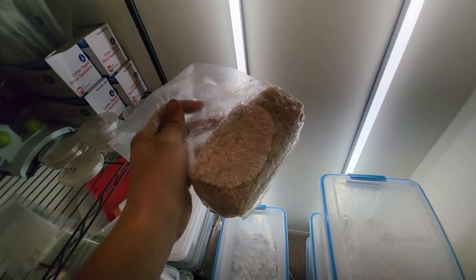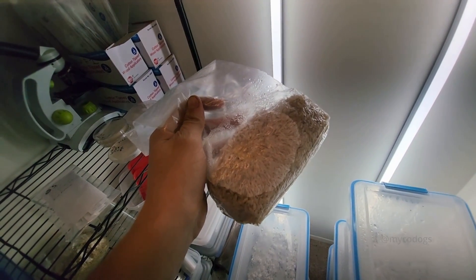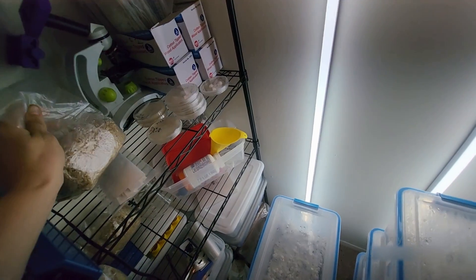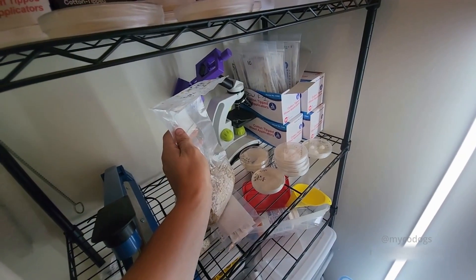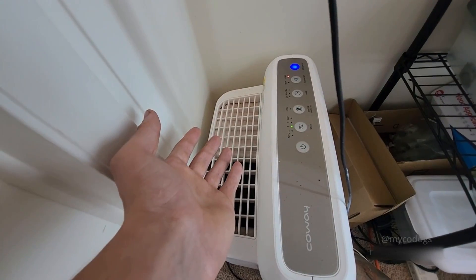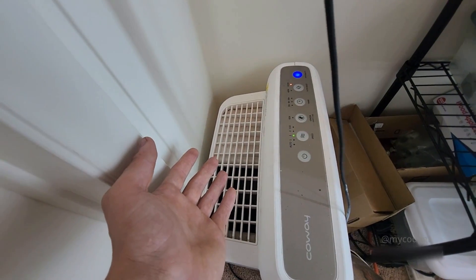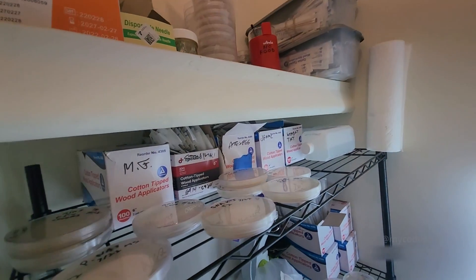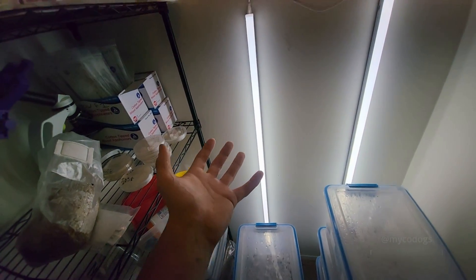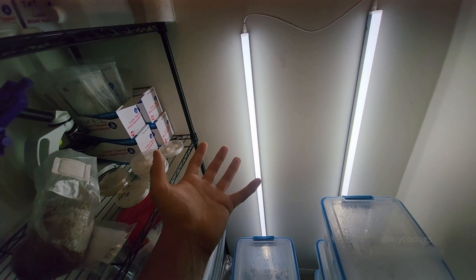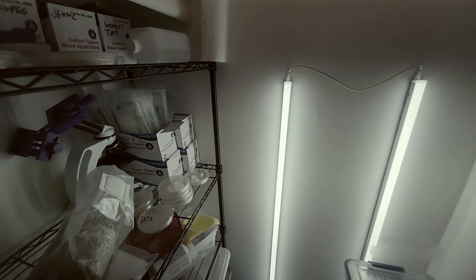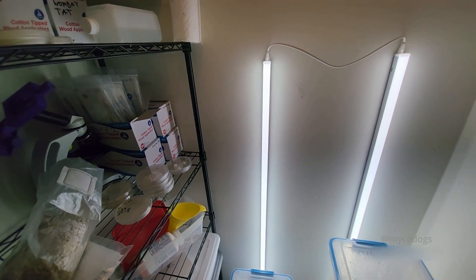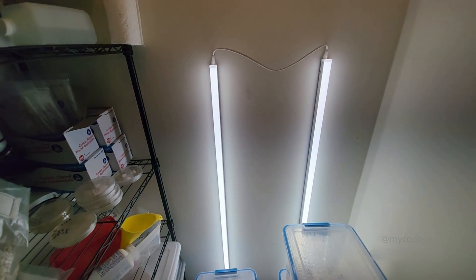While it's easy to sterilize something that's in a bag or a jar, the problems arise when you need to open them in a non-sterile environment. Ideally, all you would need to do is run an air filter to create an entire room of sterile air. But can we ever achieve a completely sterile work environment? No. In theory, it would be possible. But in practice, even the cleanest of clean rooms are not completely sterile.